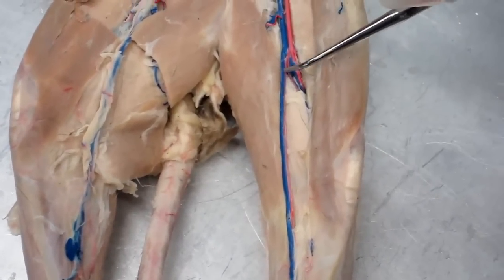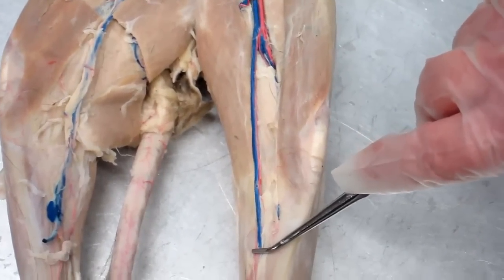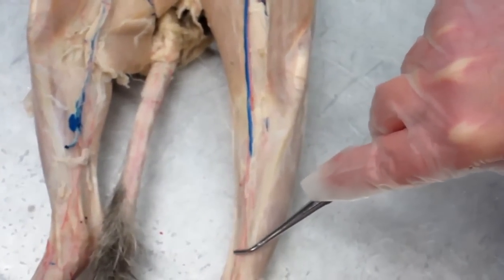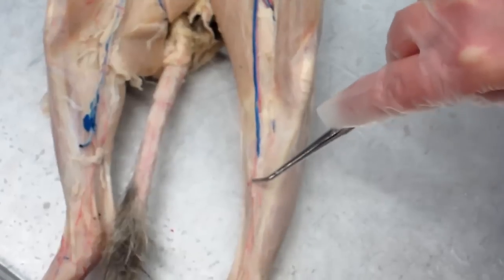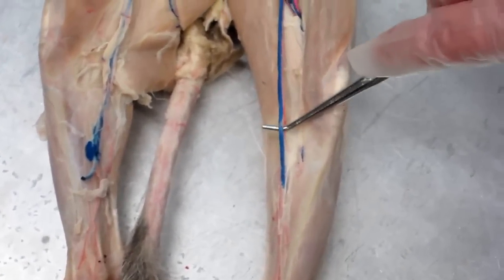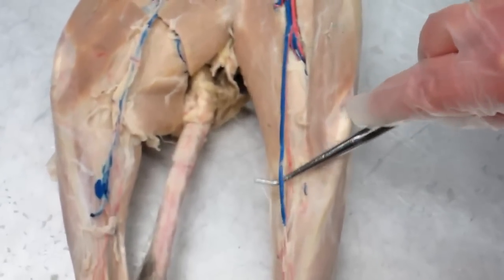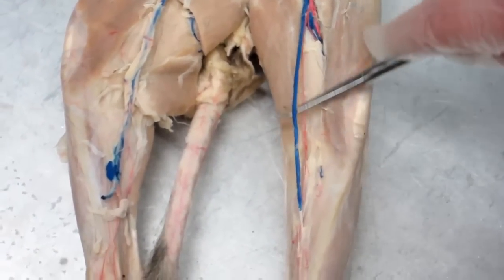Okay, and on this cat, it doesn't look quite as great, and great is meaning long here, or extensive. Doesn't look quite as great as it could, because you can see the latex kind of ending here, but in other cats, the great saphenous vein will be more obvious extending to kind of the mid or the medial ankle location. Okay, so this is in humans and in cats the longest vein in the body. They actually use the great saphenous vein in some cases as a source of bypass material for patients who need coronary bypass surgery.